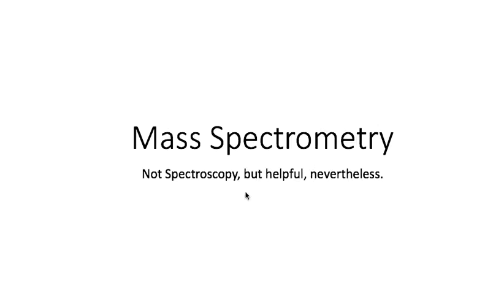Mass spec is a tool in our arsenal, in our toolbox to figure out what a given molecule is. Mass specs are used in airports. There's the machine when they wipe your hands to check for explosives or drugs. They put it into a little machine. The machine separates the molecules using gas chromatography and then runs a mass spec on them so that they can identify a given molecule.